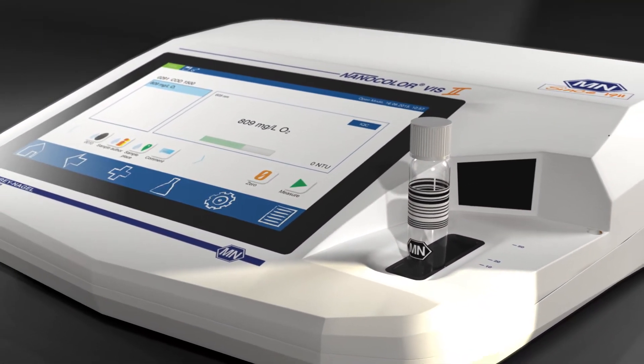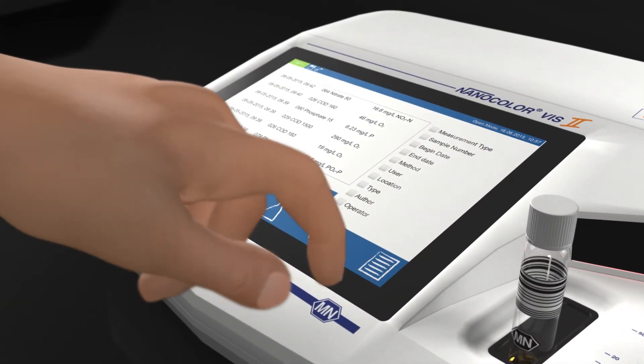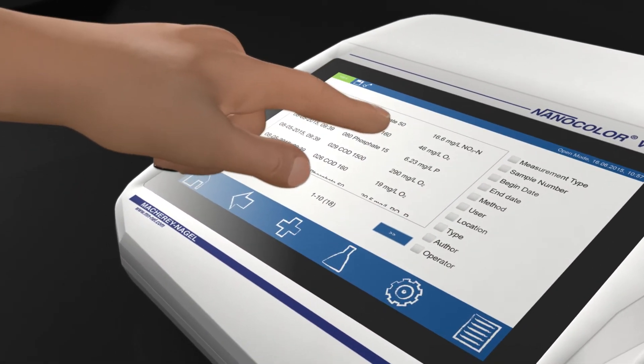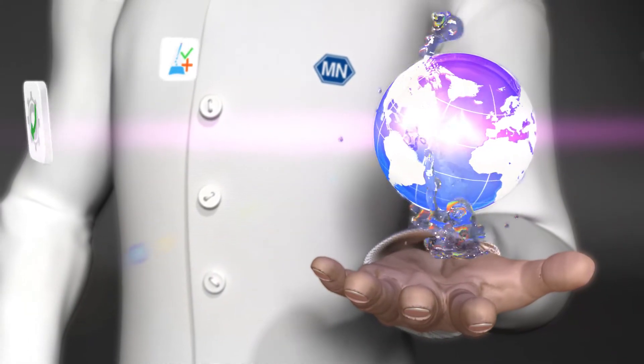Photometric water analysis has never been easier and more reliable. The VIS2 is designed to deliver more safety and accuracy when analyzing the most important substance in the world.